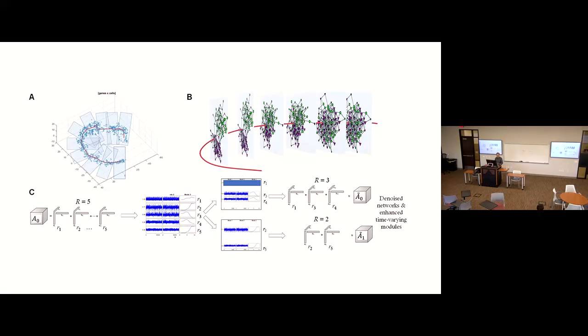So that's something I was considering to do. We try to follow the trajectory if you build it, and then use sliding windows to follow the trajectory to sample the cells. If you look at it here, this is window 1 from the early stage, then you follow the trajectory, have window 2.